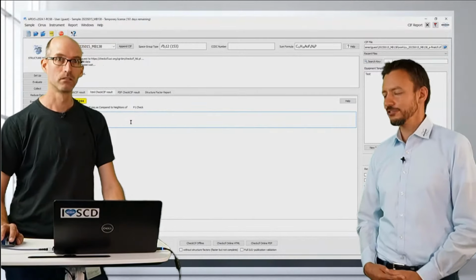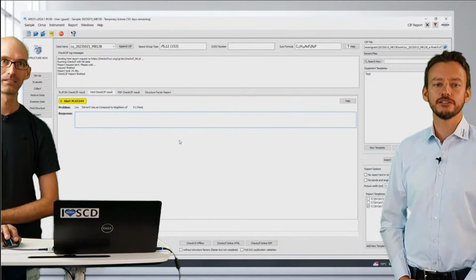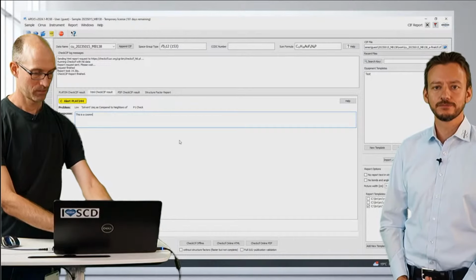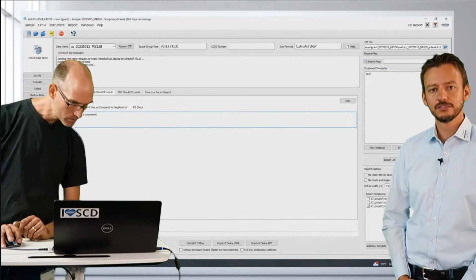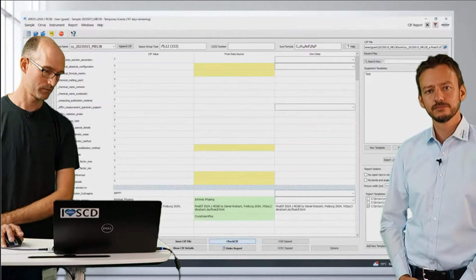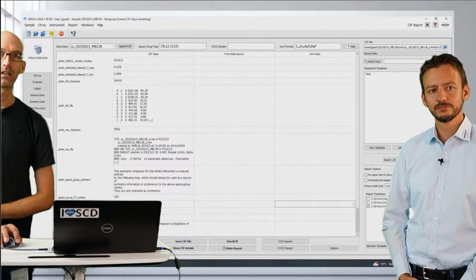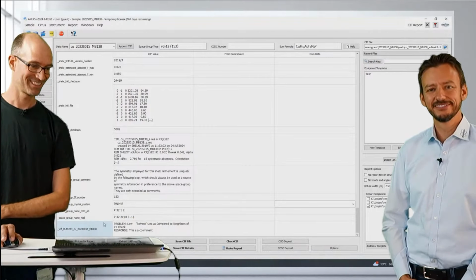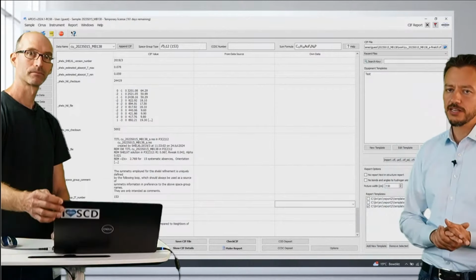And sorry for interrupting you. Just covering the interesting part. Yeah. Oh, you can directly comment on the alert. Oh, that's really good. And that will also go directly into the CIF then? Yeah. If I click on Save Response Forms, it will save it. And if I go back to the main table, we have at the end the answer about the alert here. Okay. So now we notice that the Z value is wrong.